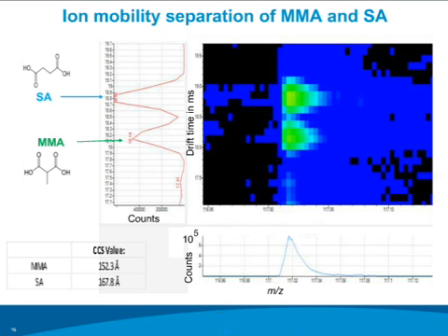Now, the example here was shown because these 2 molecules are of interest in the clinical market, and this is something that in some cases to separate these chromatographically has been difficult. So the added dimension of mobility, I think, could be applied here in the clinical market.